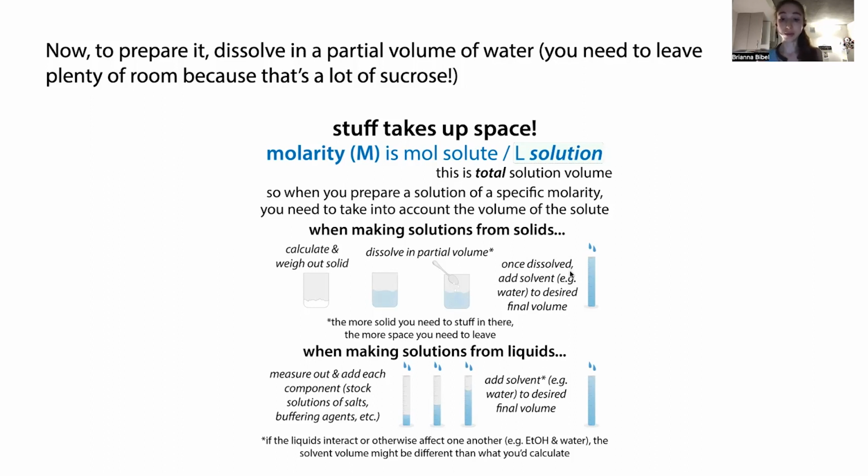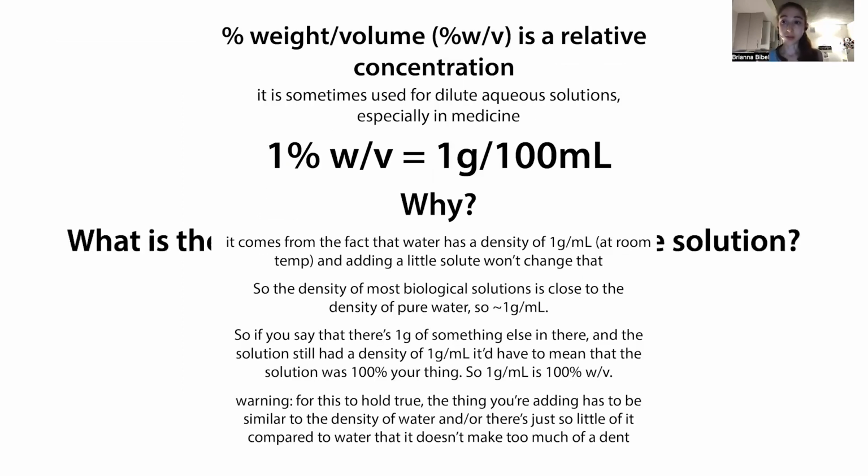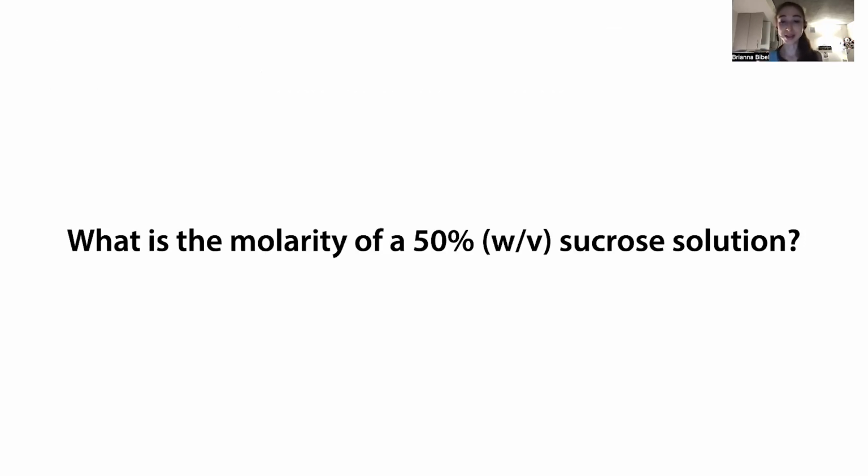And this will give you the total volume of, or fill it to 200 mils line, and this will give you the total volume of 200 mils and the solution at the percentage that you wanted, and more on preparing solutions in other posts. So that is in weight volume percentage. And again, it's not really a true percentage because your units aren't canceling out, but I'm not going to rant about that right now. What we care about more often is molarity.